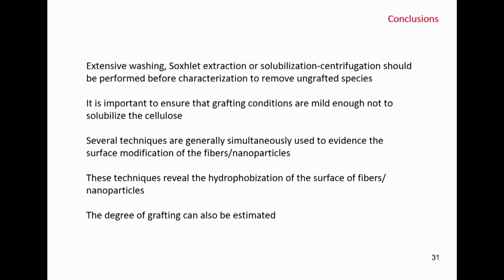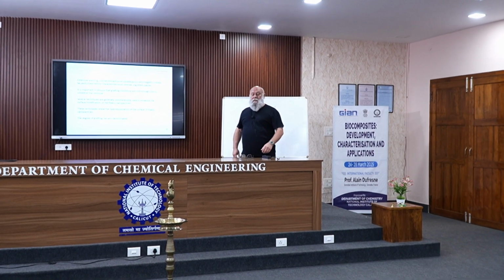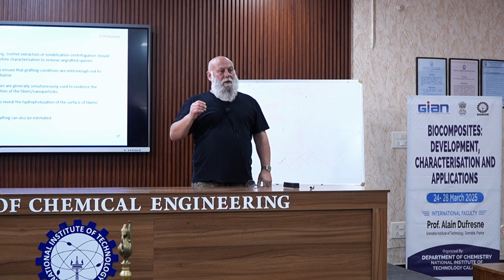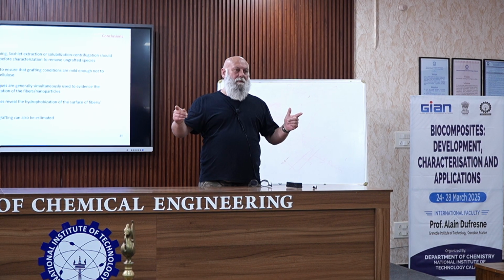I have one doubt. When nature makes these fibers or cellulose nanocrystals, will it have a very high PDI value, polydispersity index? Oh, yes, yes. You mean of the cellulose chain? Yes. And we can see this. I don't have it here, but when I show TEM images of cellulose nanocrystals, there is a very broad distribution in length.